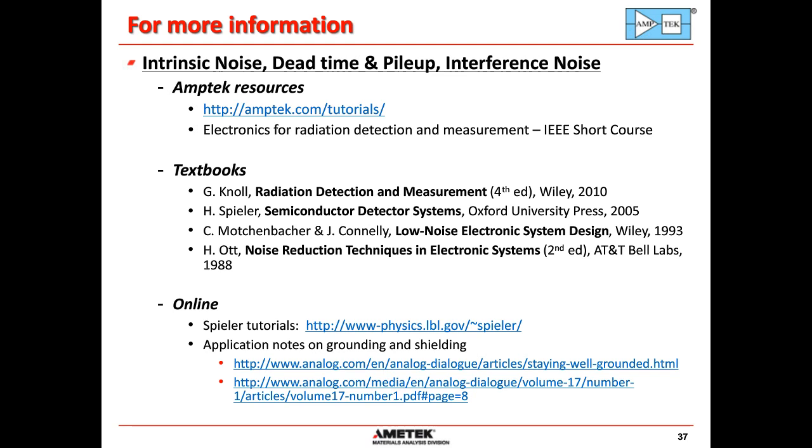Use a relatively long peaking time, around 4 microseconds we recommend. And low temperature is important, so getting down around 230 Kelvin or so. Getting below that is not particularly important. But if you were trying to measure that, it would not be possible at relatively high temperatures.